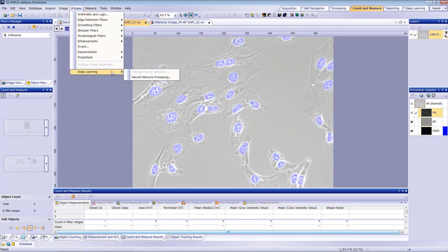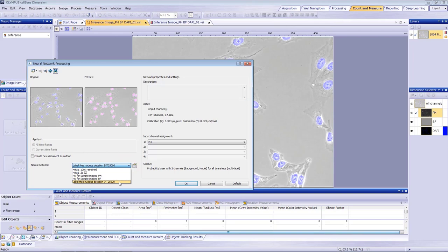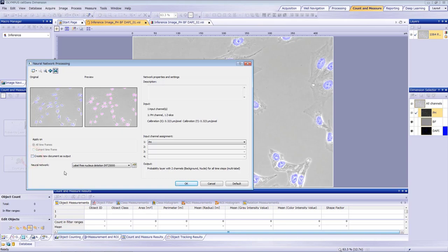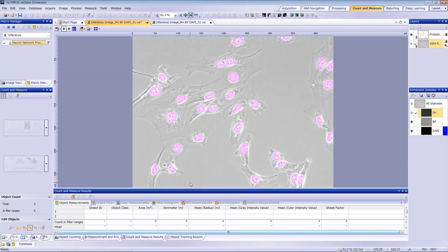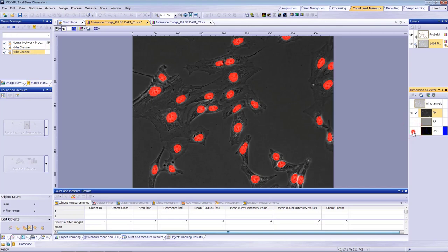From the menu bar, select Neural Network Processing and then select Neural Network. The input channel must be pH since this neural network was trained using the phase contrast channel. We recommend unchecking the Create New Document as Output box for macro recording. The resulting inference layer identifying the nuclei is shown as a probability layer. The red area shows the inferred nuclei from the pH channel.